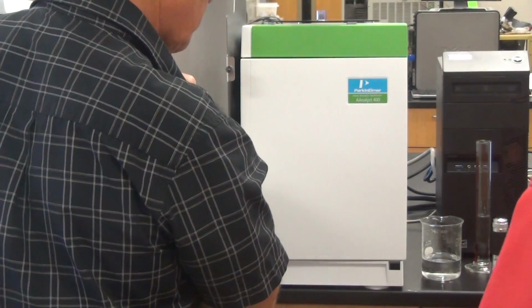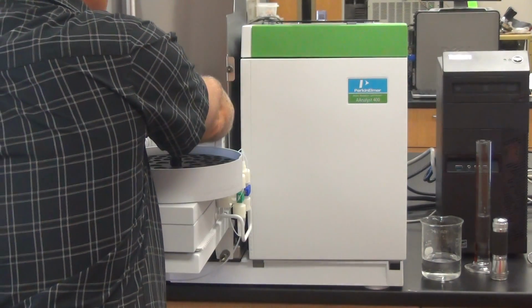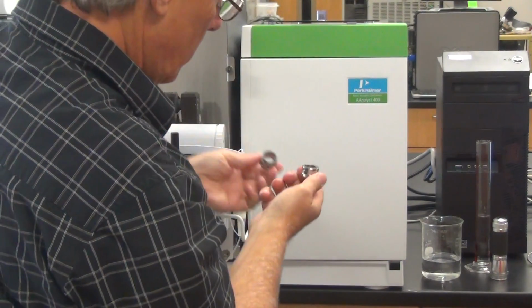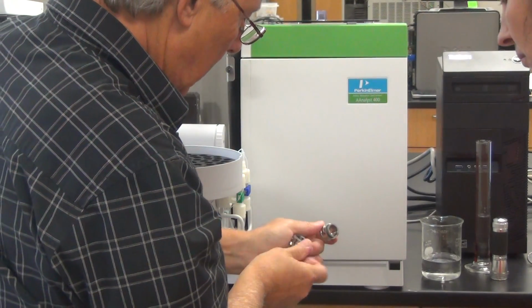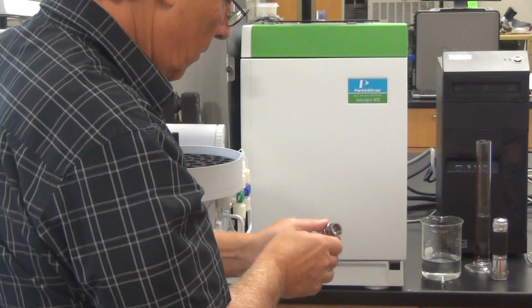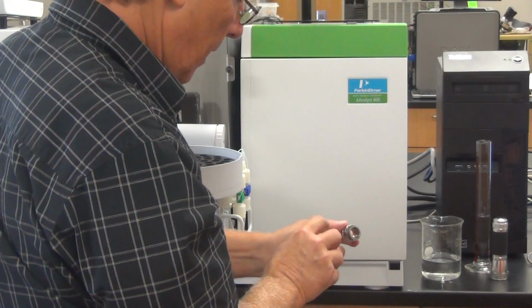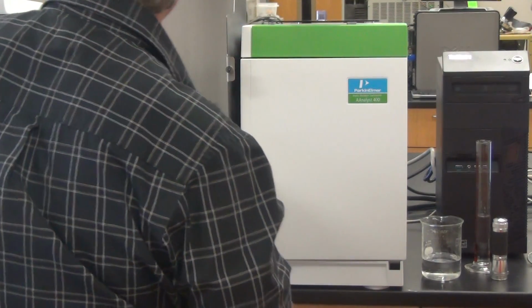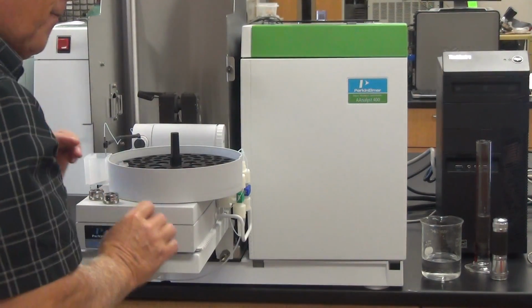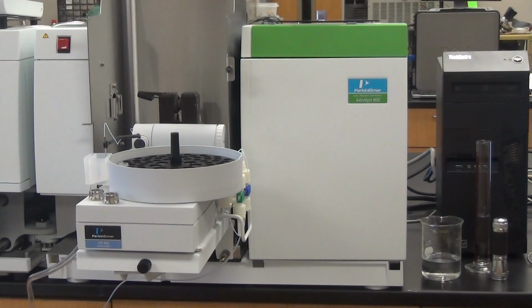So we're there. Now, what I'm going to do is pull the windows out. Don't really have to, just to show you what's there. These are just rubber. That's with the window stuck to it right now. So you just clean them and put them back in their ports. You've got to remember to put them back in there. If not, you'll burn your graphite. There's nothing that says it's not there. So I'm gonna auto zero this.